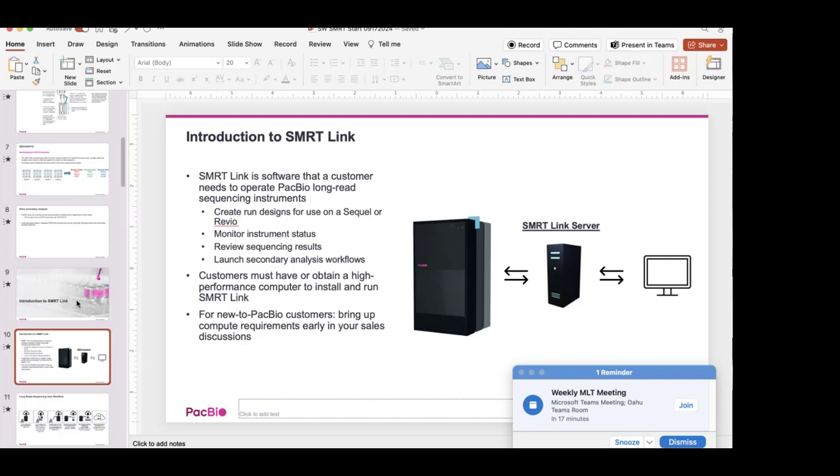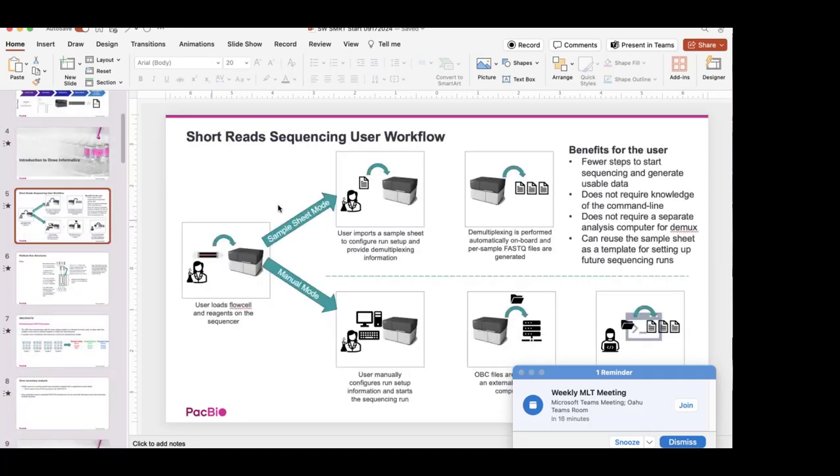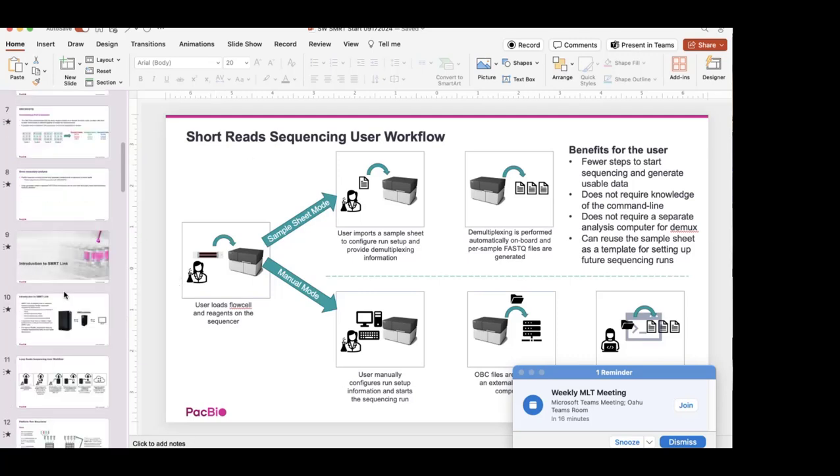There are always new developments happening, and even in the next month or two we'll have some new announcements, so a lot of this will change a little bit. We'll add scope and stuff. In the future, we would love to have long and short reads more aligned together, but at this snapshot in time, they are completely separate concepts in terms of the informatics.